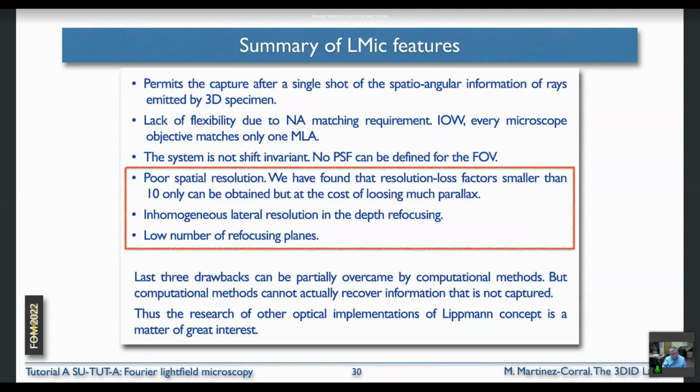These last 3 drawbacks can be partially overcome by computational methods. But in my opinion, this is a personal opinion, computational methods cannot actually recover information that was not captured. With computational methods, you can improve the quality of the image, but the frequencies which were not captured, you have lost forever, unless you have much more information about the sample.